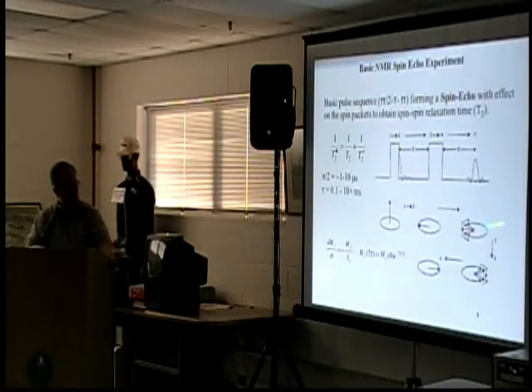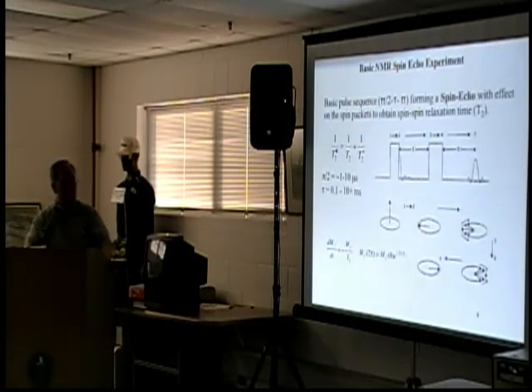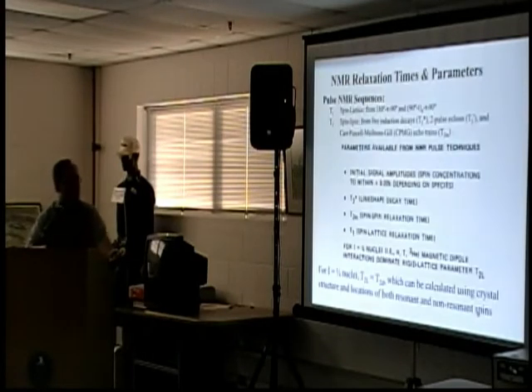You then do this for different times. I'm sorry, when I copied over things, this is 2 tau over T2, that time constant. From the amplitude, you can get the time constant, so you measure a time constant for this process. That's what the T2 spin-spin relaxation time is all about. There's also a time constant related to the system returning completely to equilibrium. That's called the spin-lattice relaxation, lattice being degrees of freedom not associated with the spin system. You can measure that in a different manner, which I think I have listed in the next slide.